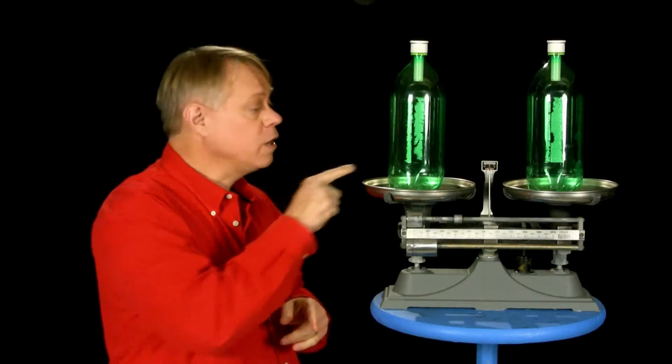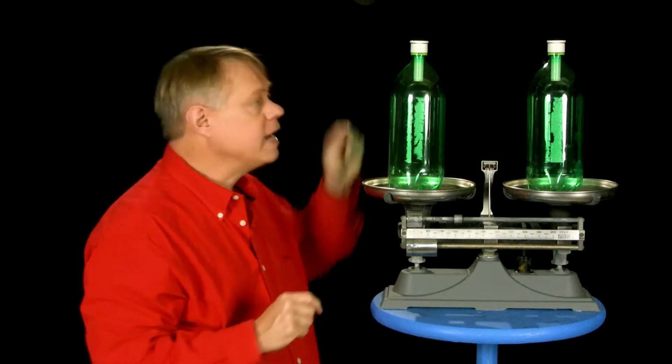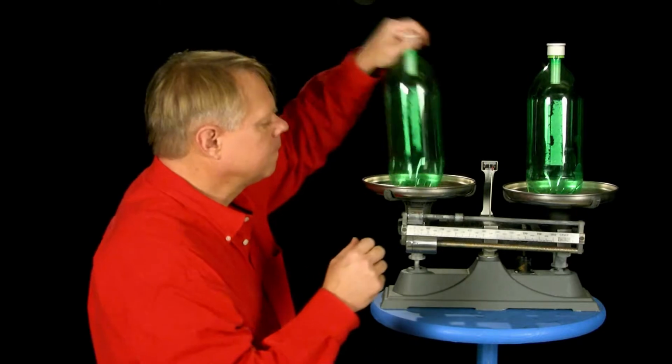Here is a balance, and here is a plastic bottle. This bottle is balanced by the weight of the other bottle. And here is a pump by which we can force the air into the bottle, and with it we will force in a certain number of volumes of air.